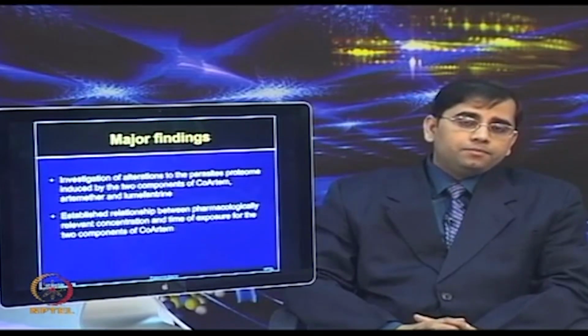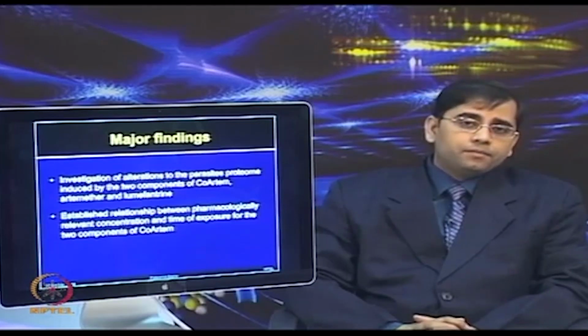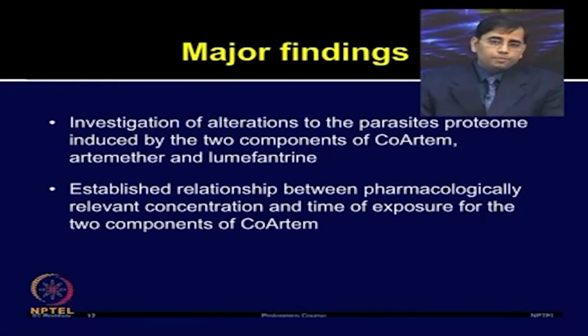From this study, the major findings were that the authors successfully investigated alterations of the parasite proteome induced by two components of Coartem, artemether and lumefantrine. By using a proteomic approach, they investigated specific and non-specific effects of two antimalarial drugs in pharmacologically relevant conditions.